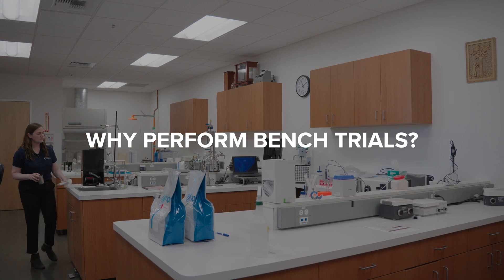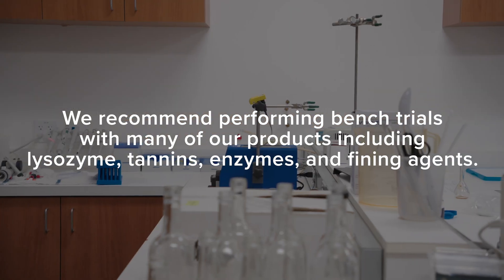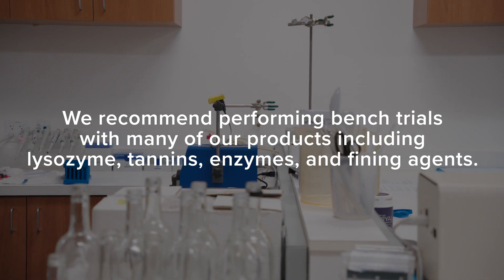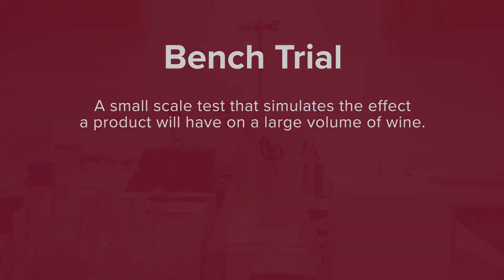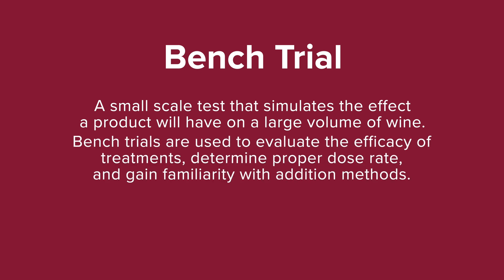Why perform bench trials? We recommend performing bench trials with many of our products, including lysozyme, tannins, enzymes, and fining agents. A bench trial is a small-scale test that simulates the effect the product will have on a large volume of wine. Bench trials are used to evaluate the efficacy of treatments, determine proper dosage rate, and gain familiarity with addition methods.